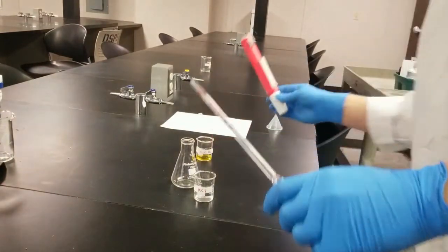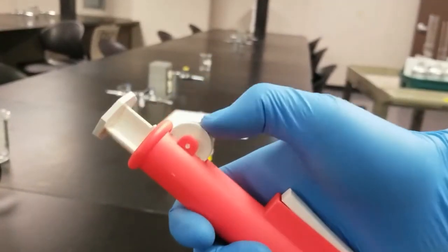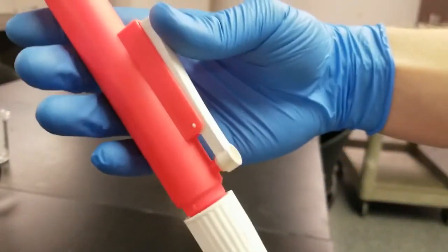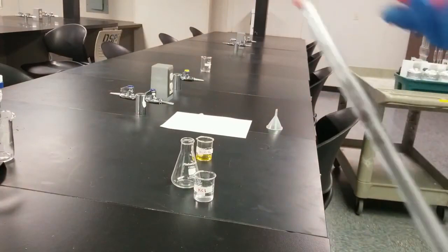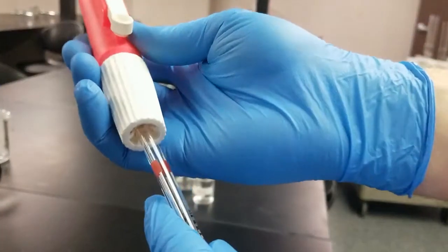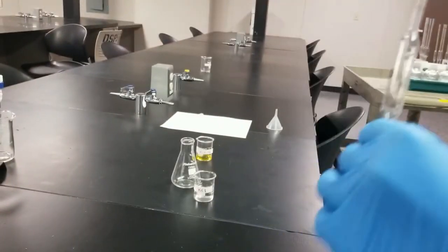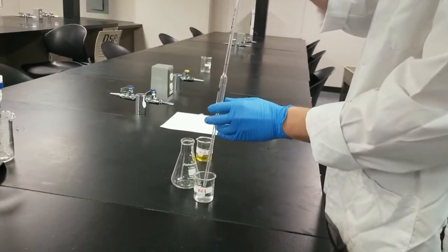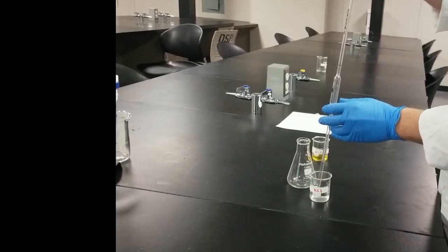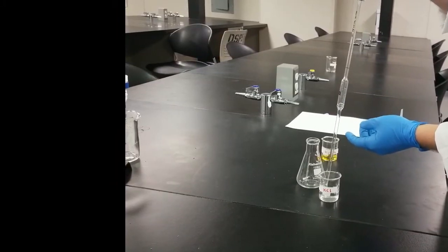And to do that, we're going to use this pipette bulb. We're going to stick this on here and then just turn this knob to suck some stuff up. And then when we want to dispense it, just press that button right there. So let's check it out. Insert my pipette bulb nice and tight. And now I'm going to fill with 10 mLs of the potassium chloride. Put my pipette in the solution and then start turning this knob and get to the 10 ml mark.